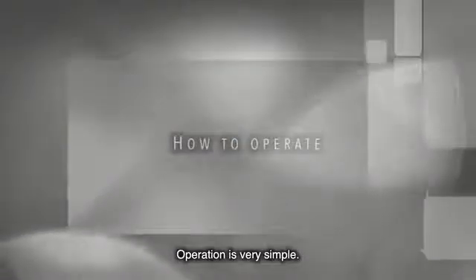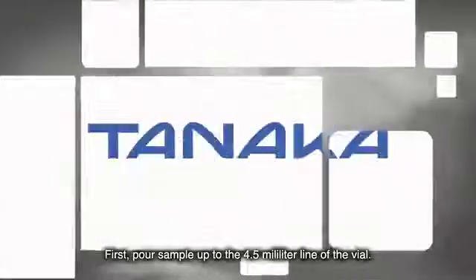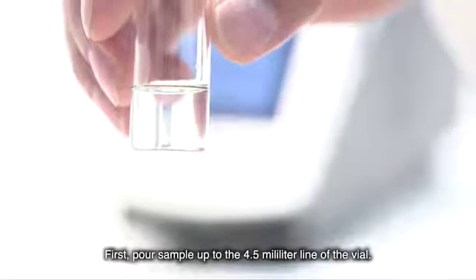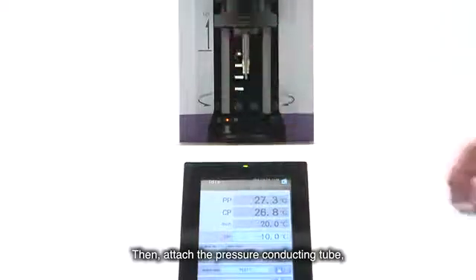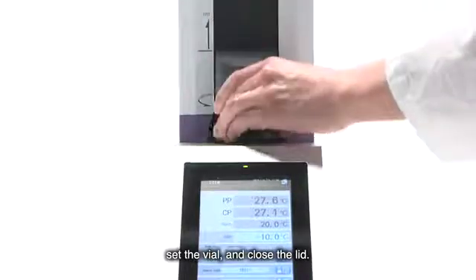Operation is very simple. First, pour sample up to the 4.5 milliliter line of the vial. Then, attach the pressure conducting tube, set the vial and close the lid.